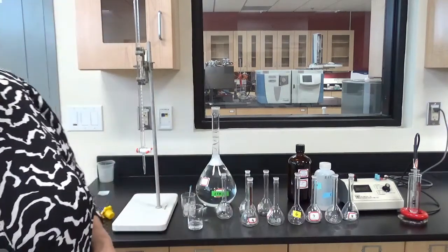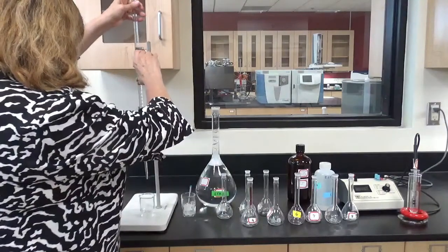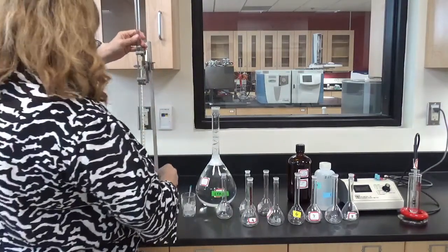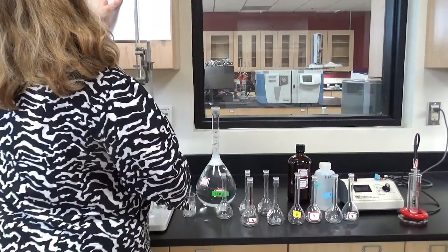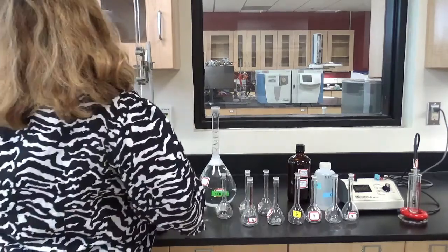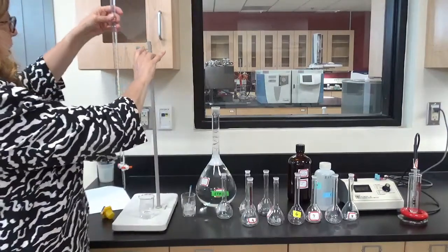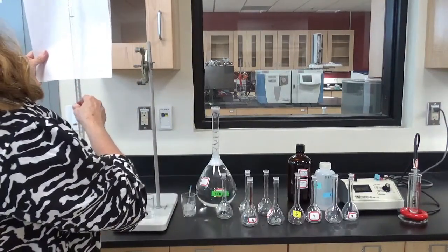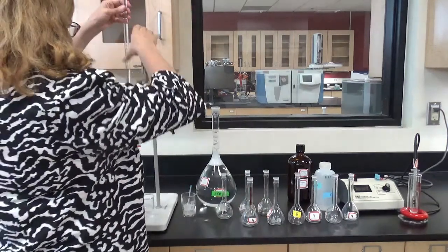And you know what? I think I'm actually going to let some more out. I always tell students not to do this, but I don't really want to be looking at this 0.28. I just want it to be on a milliliter number. So that is now 2.0. Just make sure, because I don't have a very good straight-on view of that. Yes, 2.00 milliliters.